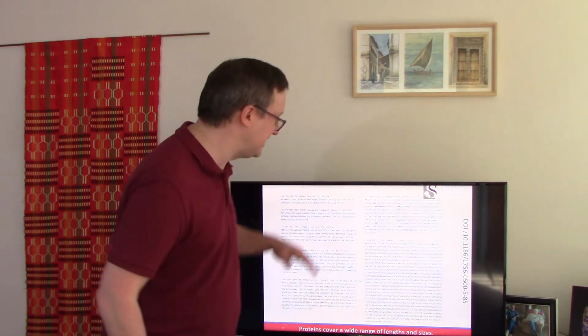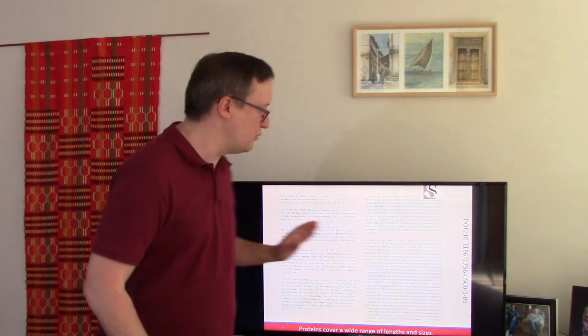Is it the biggest protein in humans? Not even close. If you look at something like human titin, you'll be looking at a really large sequence. If I try to put this on screen, it would basically have as many lines of sequences as everything here, plus more. It's a very big protein. So when we get into these larger and larger sequences, trying to make sense of the spectra they produce becomes more and more problematic.